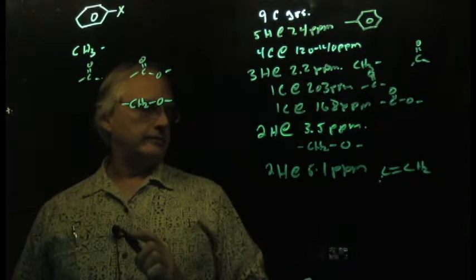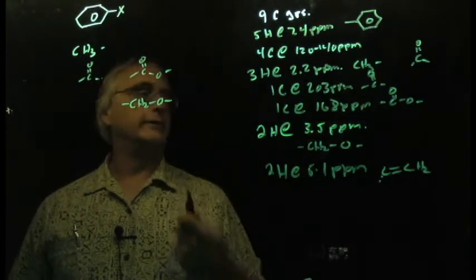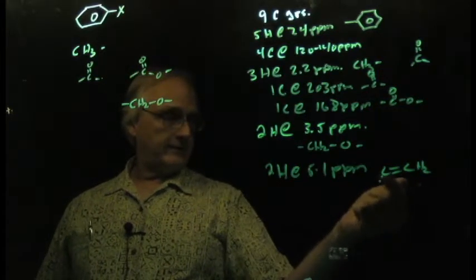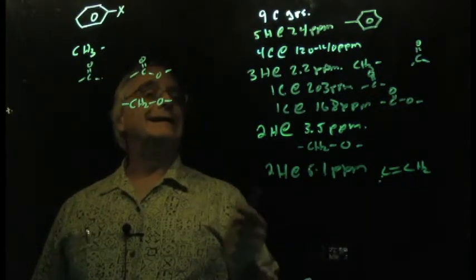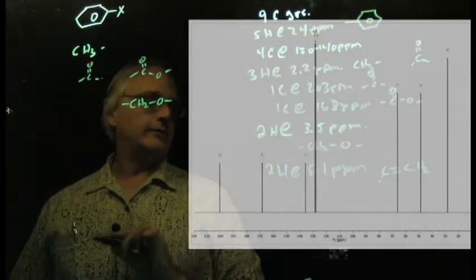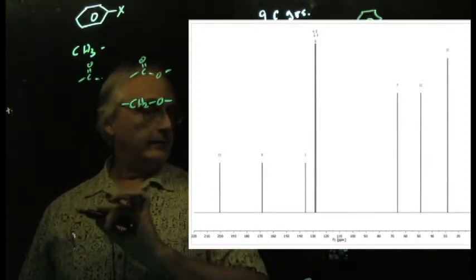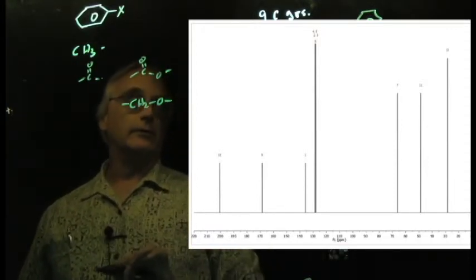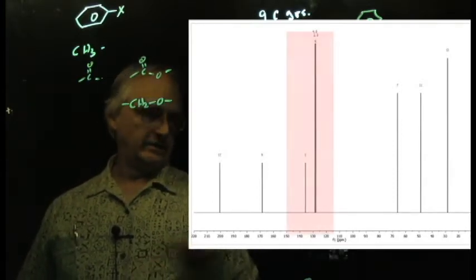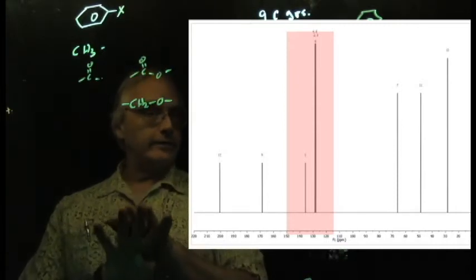But as we always do, if we propose a ketone, we look for the carbonyl signal in the carbon spectrum. If I'm going to propose an alkene, I had better find those two carbons in the carbon spectrum. So take a quick glance at the carbon spectrum and realize there are no other carbons in that 110 to 140 ppm range, where alkene carbons and aromatic ring carbons do tend to overlap each other.